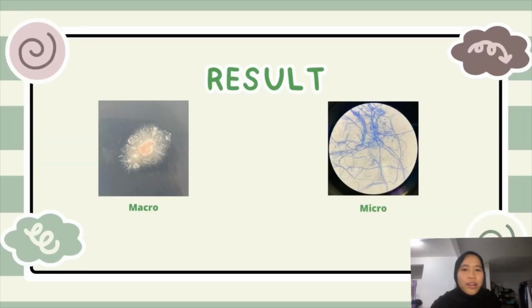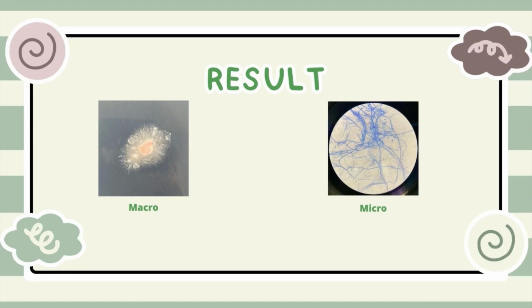The results show the structure of macrofungus and microfungus.